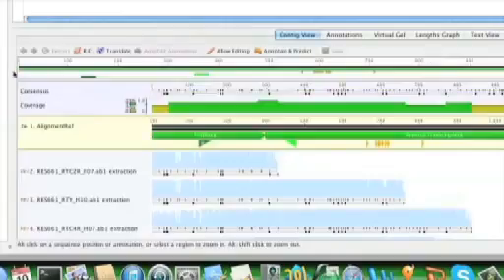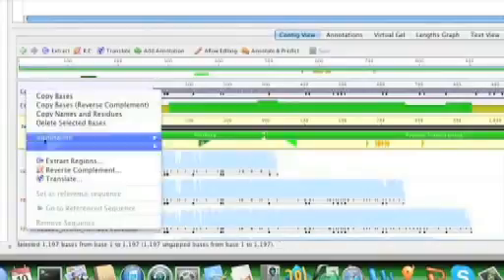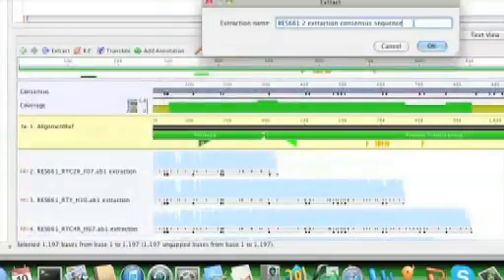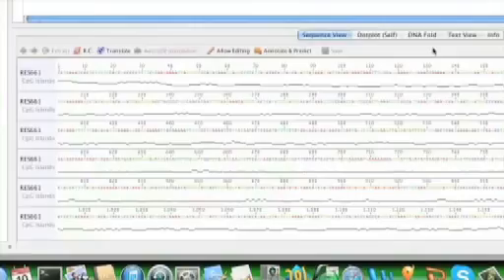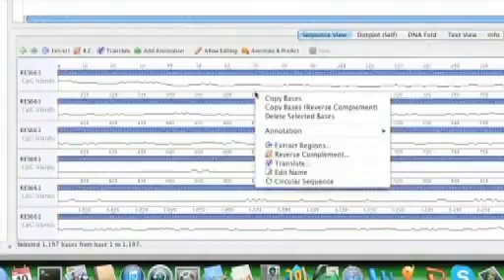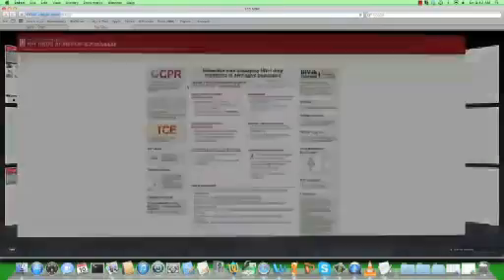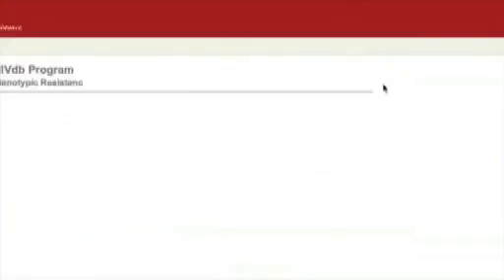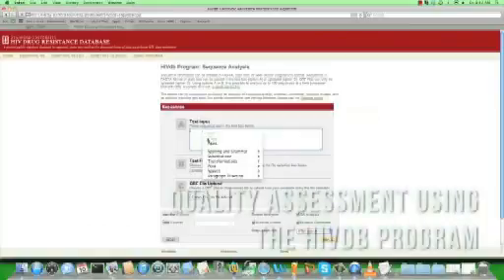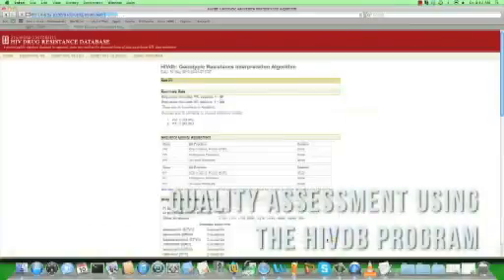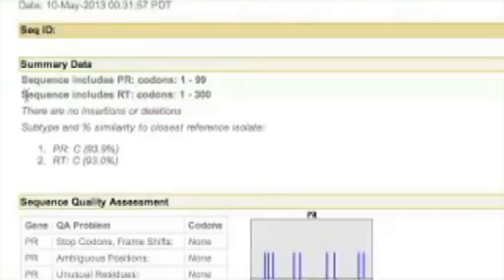Select the consensus sequence and click the extract button to create a separate file of the consensus sequence generated from the four primers and label it appropriately. Export the sequence to a backup storage folder on the computer or network. Analyze the sequences using the HIVdb program at hivdb.stanford.edu. Check for deletions and insertions on the summary data and that the sequence covers all the 99 protease codons and the first 300 RT codons.